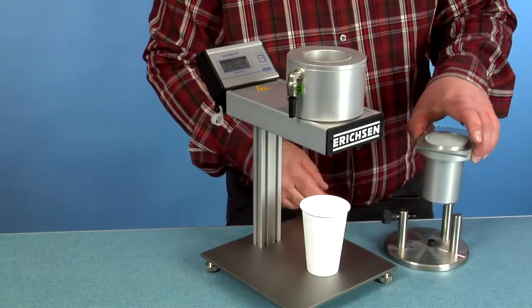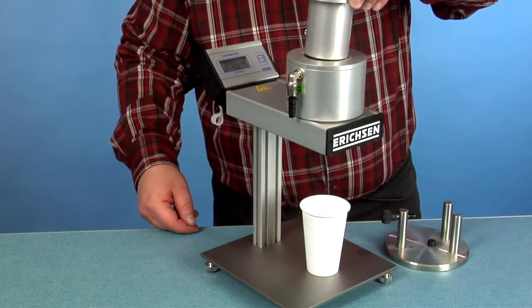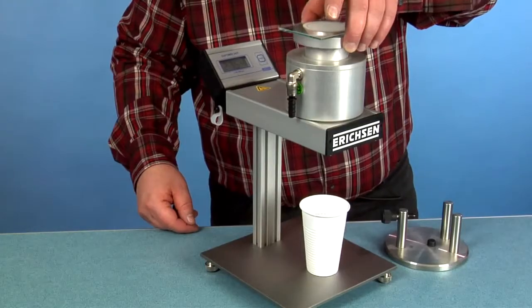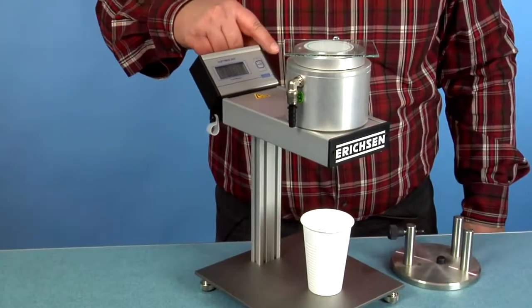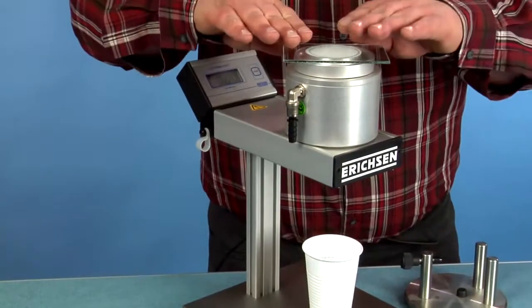Remove the flow cup from the filling support stand and insert it into the temperature jacket. After tempering, press the reset button and remove the glass plate. The counter starts automatically.